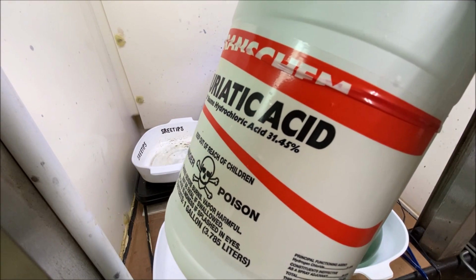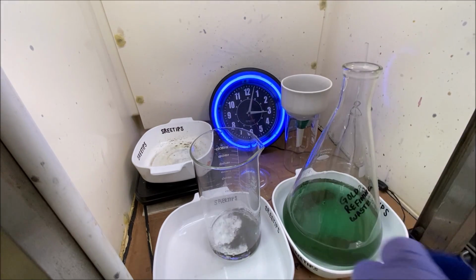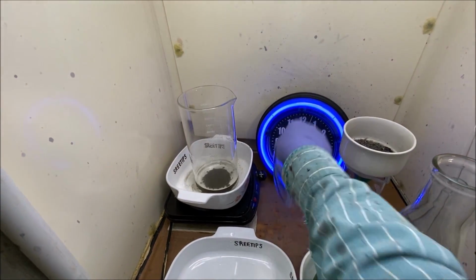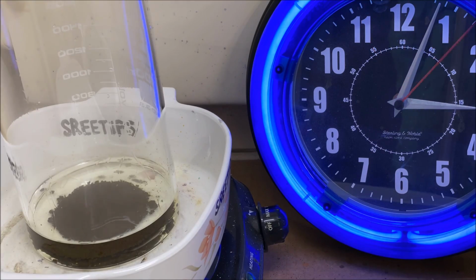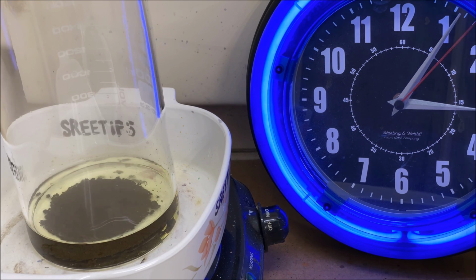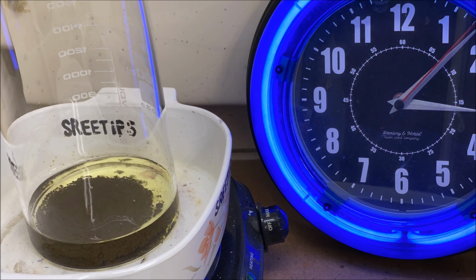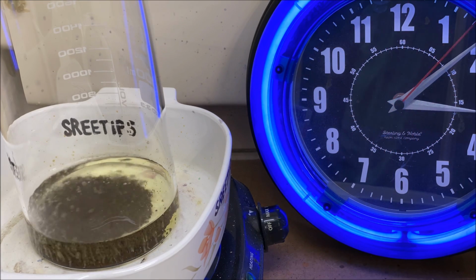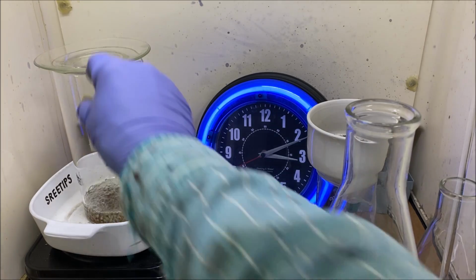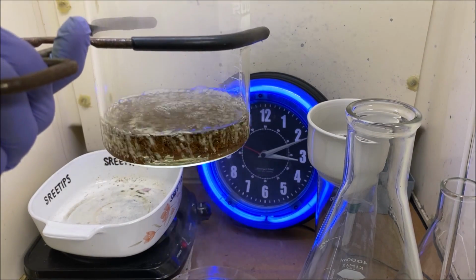I'm adding hydrochloric acid, about 200 milliliters. We're going to give this gold a boil in some hydrochloric acid now. Set it up on the heat and let this boil. Let's go ahead and pour this hydrochloric acid boil off now to our waste container. Got a little color going on in there.